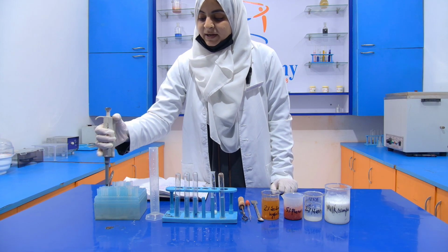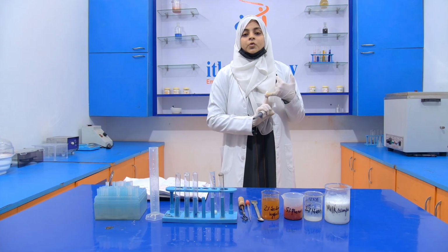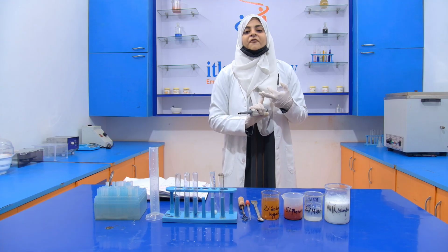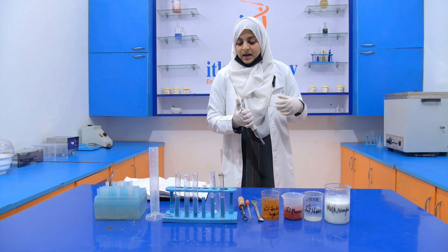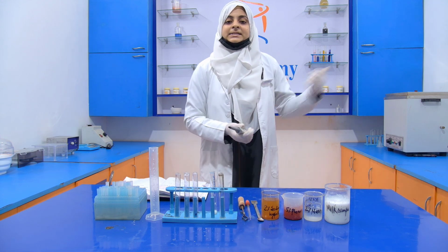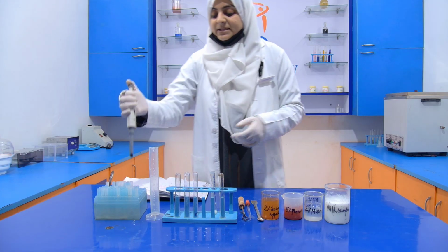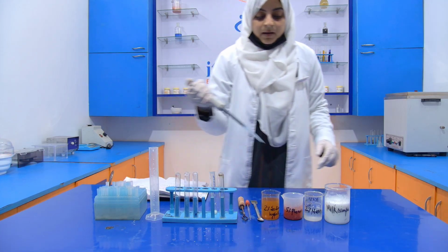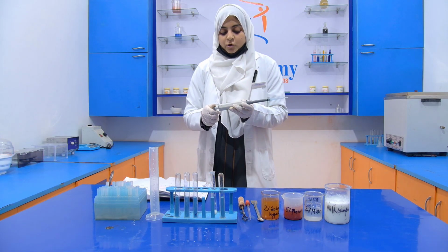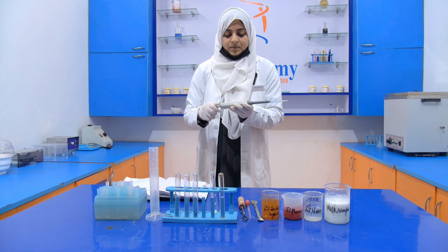Then after taking the sample, we have to add 0.5 ml of sodium hydroxide, 0.5 ml of sodium hypochlorite, and 0.5 ml of phenol. Then after that, we heat it for 20 seconds inside the water bath, and if a deep blue color appears, then it means that our sample is adulterated with this ammonium salt. If we don't get any color, then it means that our sample is pure.